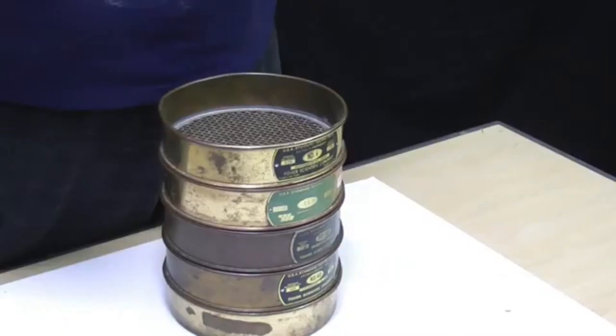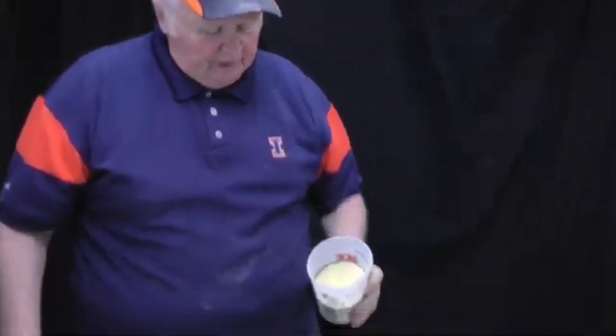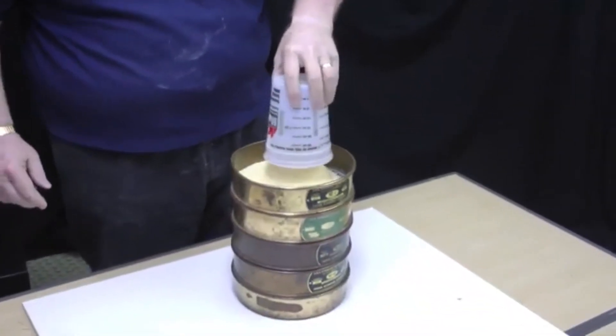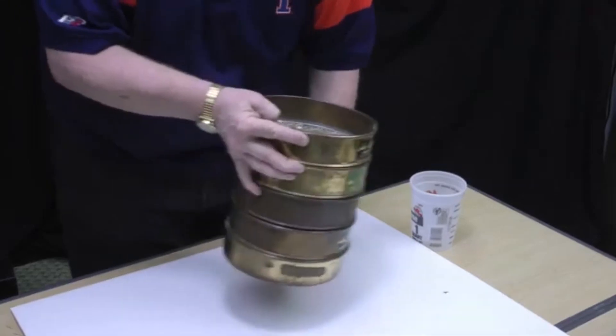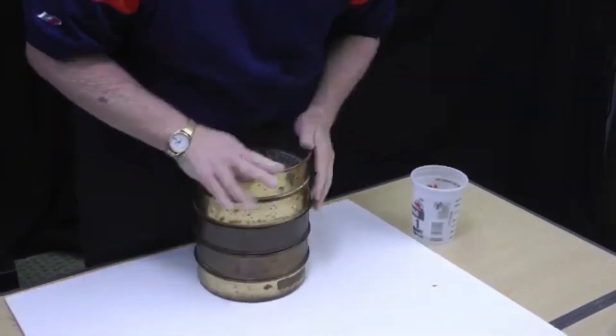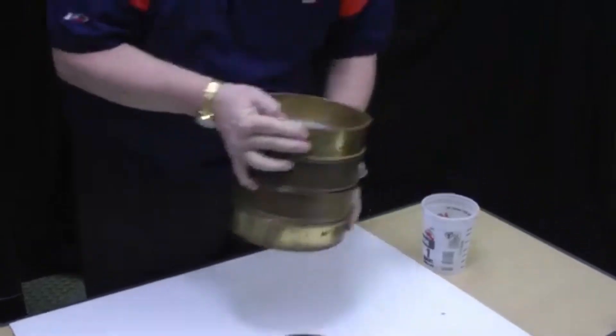We have our five screens stacked on top of each other. We will be adding about a cup and a half to two cups of dry ground grain into the top screen and then shake it. You can either keep it flat on the table or hold it — we're not too worried about shaking the particles vertically or horizontally.